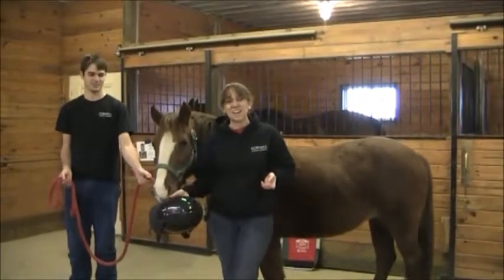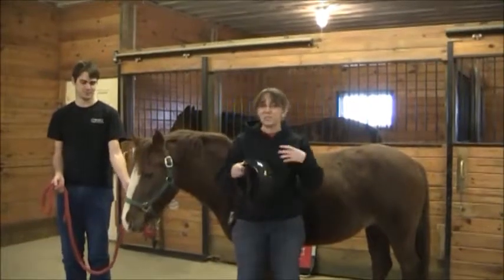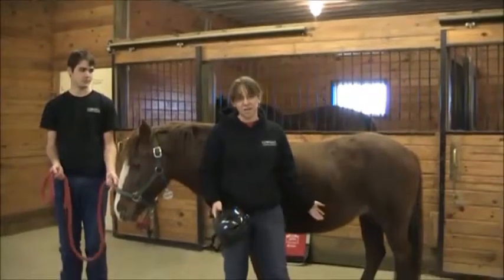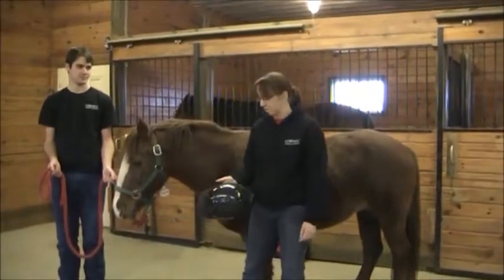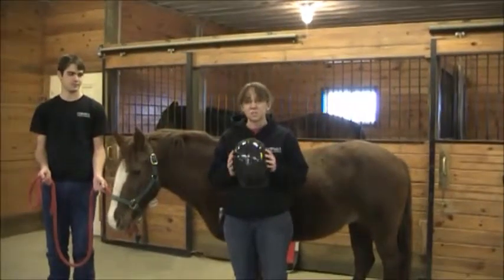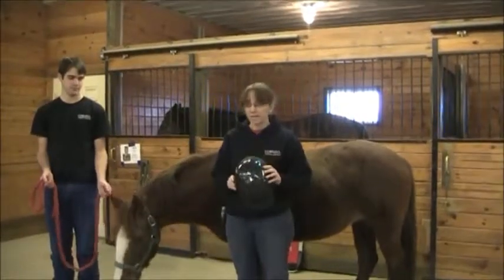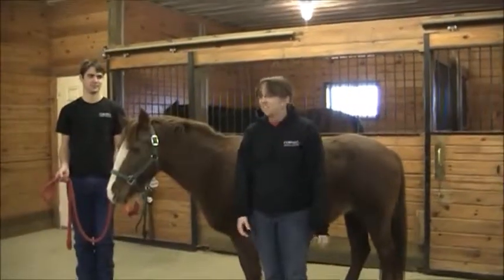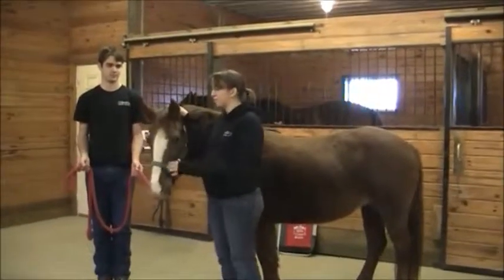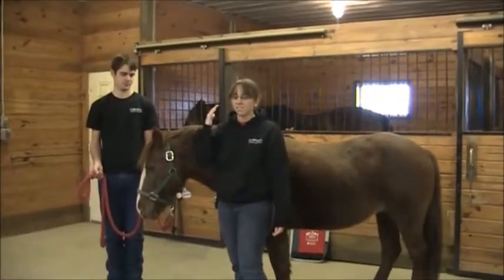Hi, I'm Ann Steiger, a graduate student in the Brooks Lab. I'm here to talk about safety, show you all the measurements, and how we pull hair for the Get a Leg Up on Science project. The most important process is safety. If you're under the age of 18 and taking body measurements, you want to wear a helmet. You also want to make sure that if the horse's head is down, your head is never above the horse's head, in case it comes up and hits you.